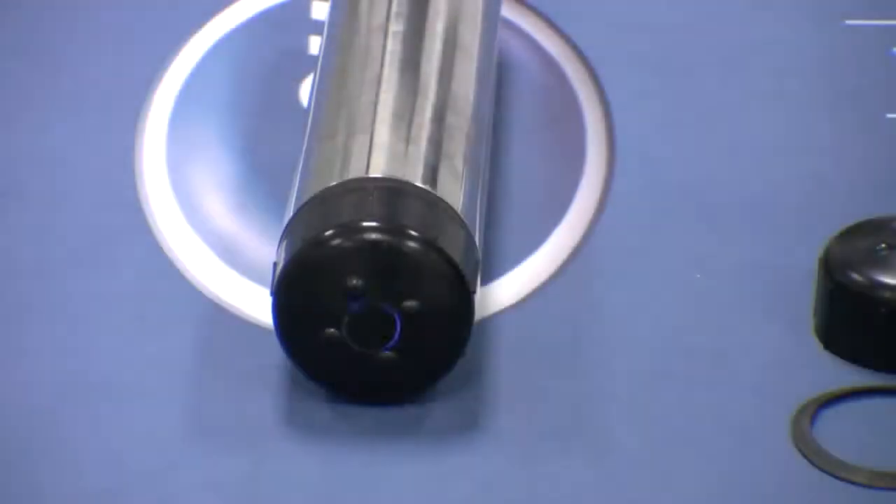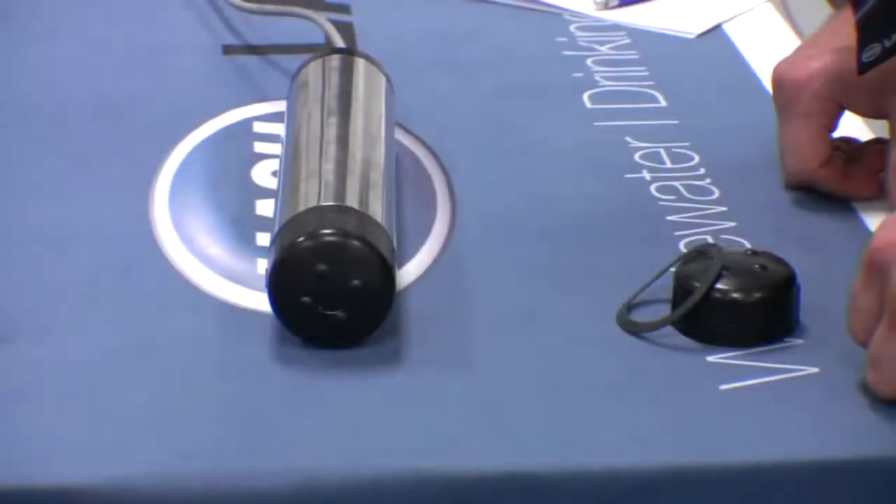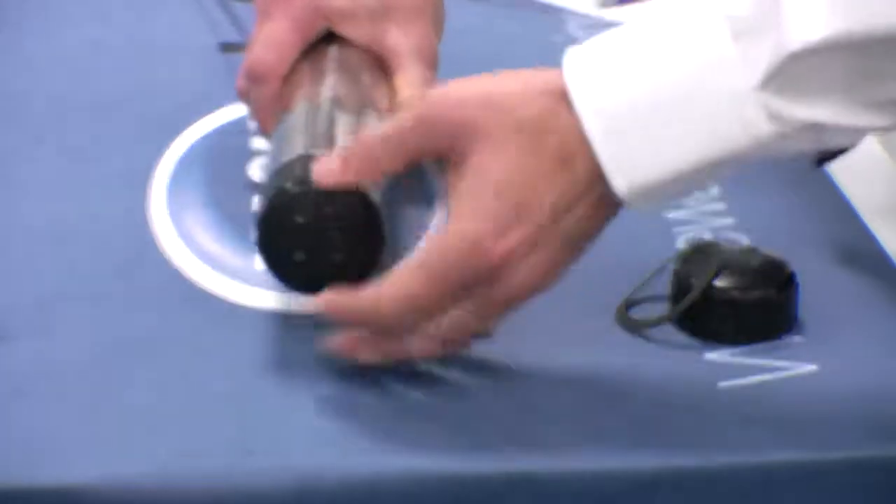The LDO cap is an integral part of the operation of the LDO probe. It houses the lumifor material which enables the probe to measure dissolved oxygen. If this lumifor is damaged or the cap reaches the end of its two-year life, it needs changing. In order to change the cap, take the probe out of its application and remove the old cap and its sealing ring.